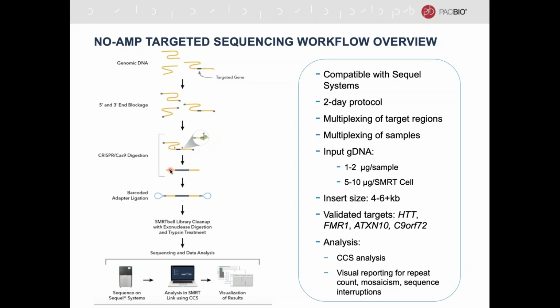And this is basically what you will get. You have a DNA fragment that contains your region of interest with free ends. This is important since all the other ends are now blocked. That means when we introduce the sequencing adapters, the hairpin adapters that Paul was talking about, they can only bind to fragments that have free ends. So it will only be available to the ones that have your region of interest. Next, we do a cleaning step, and then we take it in for sequencing.